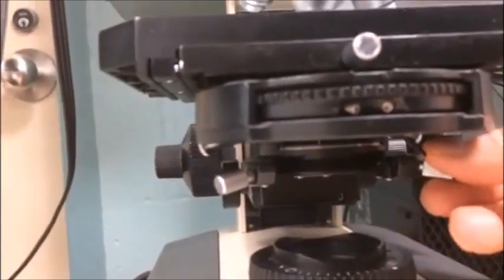There are two knobs underneath the microscope. This knob here, and this knob here. And if I turn the knobs, watch what happens. It causes the light, the decagon of light, to move around in the screen. So what you want to do is turn these two knobs here, this one and this one, until the spot of light is centered right in the middle of the field. Once you've done that, then you're done with the condenser adjustment.